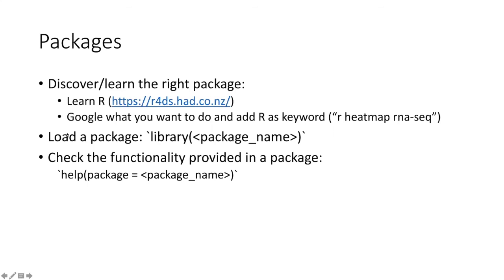Once you have the package installed, you can load the package using the library function. So you put the package name inside the parentheses. You don't have to add the double quotation marks for this package name. Just keep that in mind.